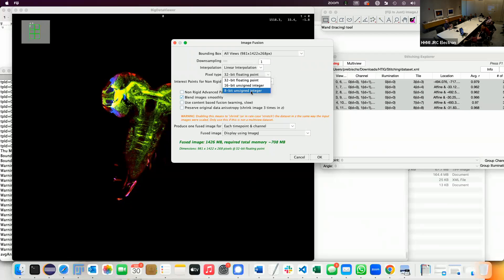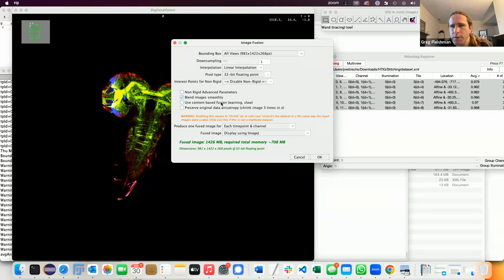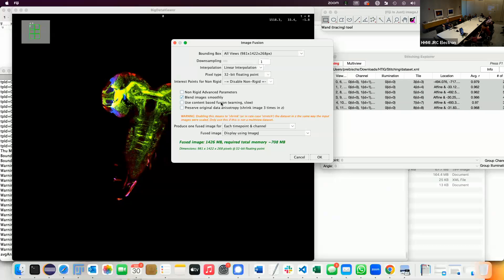You usually want to blend images — this applies a cosine blending function at the overlaps. The closer you are to the boundary of an image the more the weight goes down. If there's no other image it will still be fully there. Why cosine? Because it has less artifacts — it's a very smooth function for the weight. We could use any other function but cosine is a very natural choice — it goes from one to zero. We use a lookup table so it's as fast as linear blending. We used linear very early on, but cosine just looks much better.